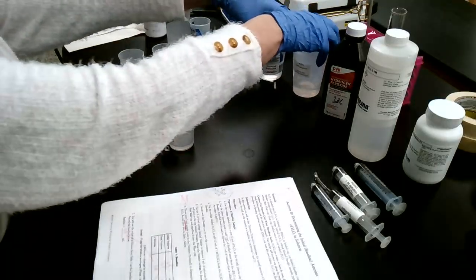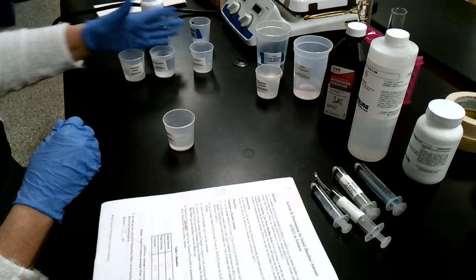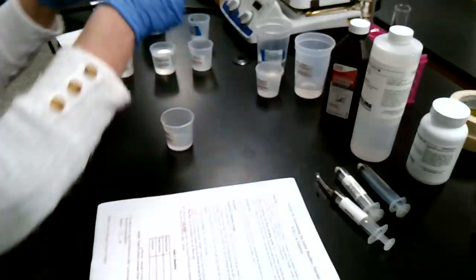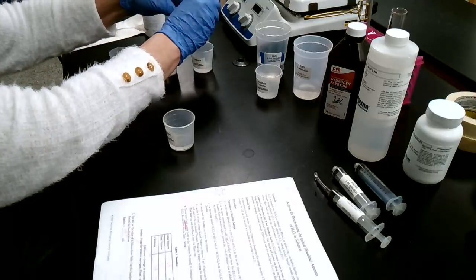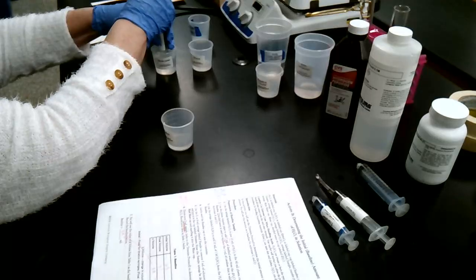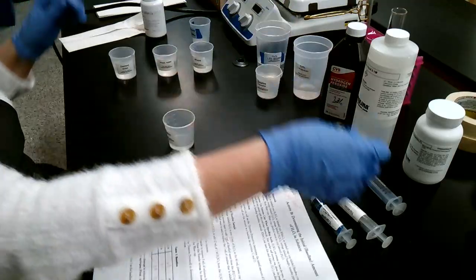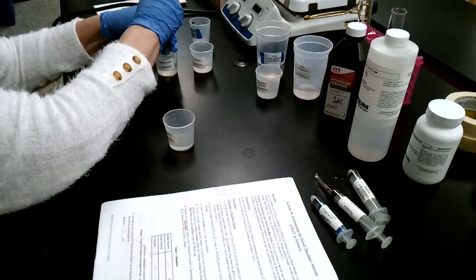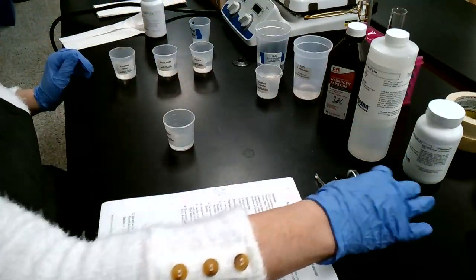I'm going to show you how to titrate this. Let's move the sulfuric acid out of the way. And of course, over here you can see I also have some spare distilled water. I've got some wash water, because even after I use this transfer syringe, it's a good idea to rinse it out and put the waste in there. Same thing with your sulfuric acid. It says wash water. Please put distilled water in there, because you want to wash it with distilled water. You never want to wash with sink water. I'm even going to wash my hydrogen peroxide one out. Wash them all out. So they're all washed out and ready to go.